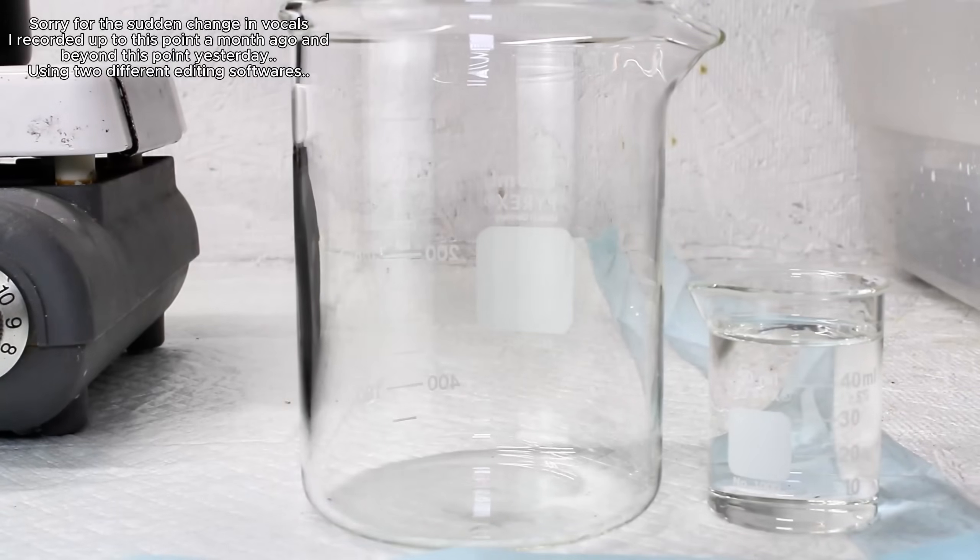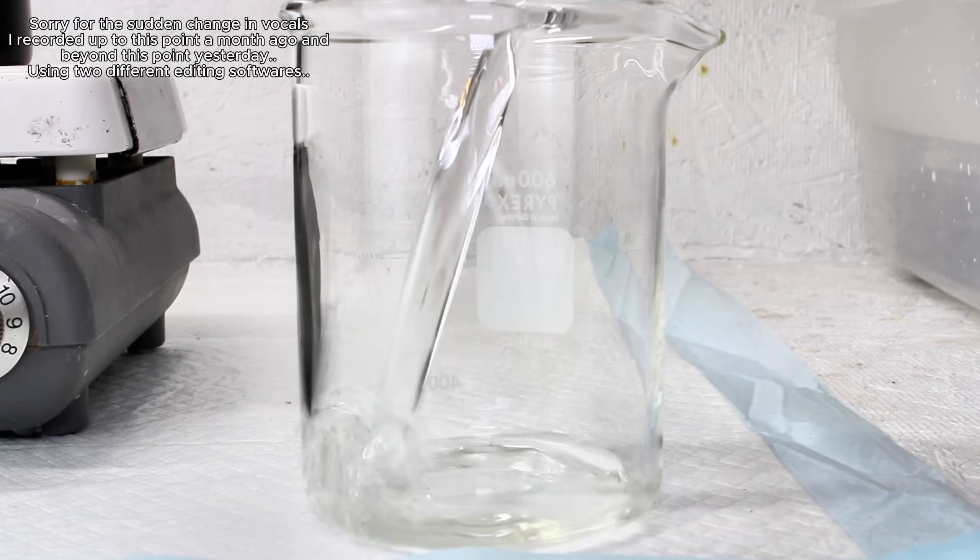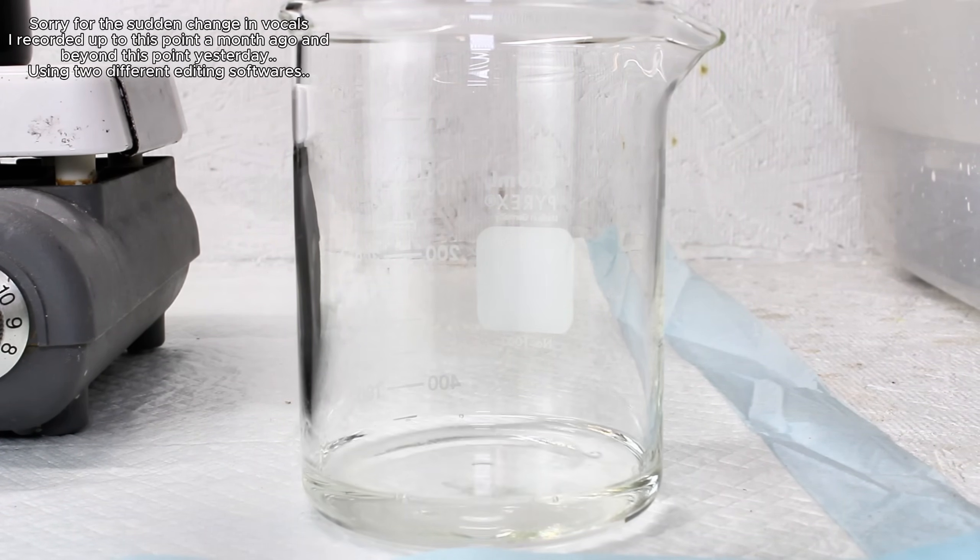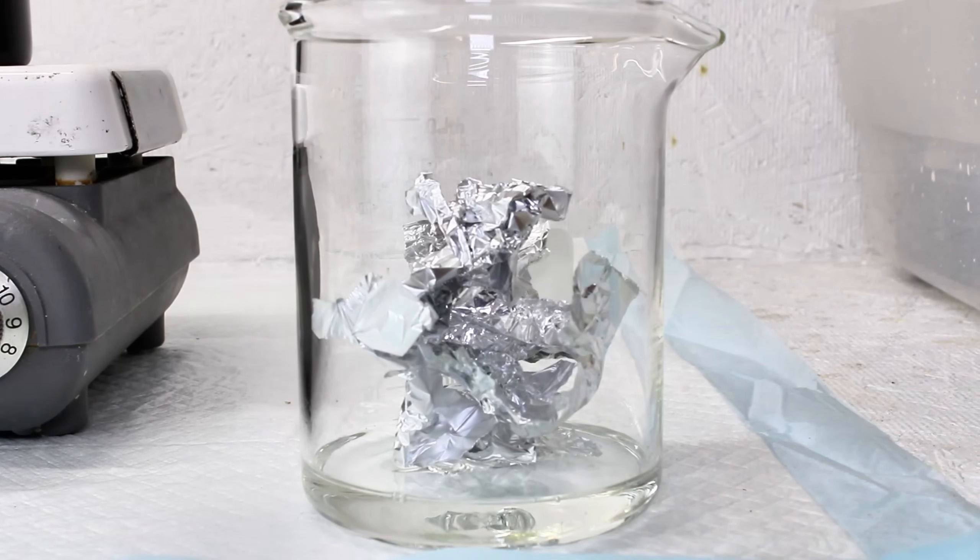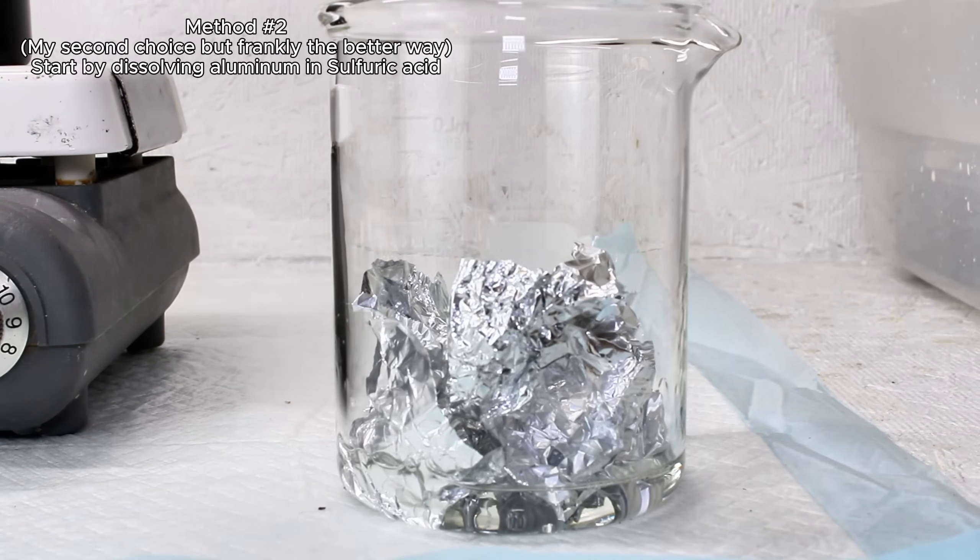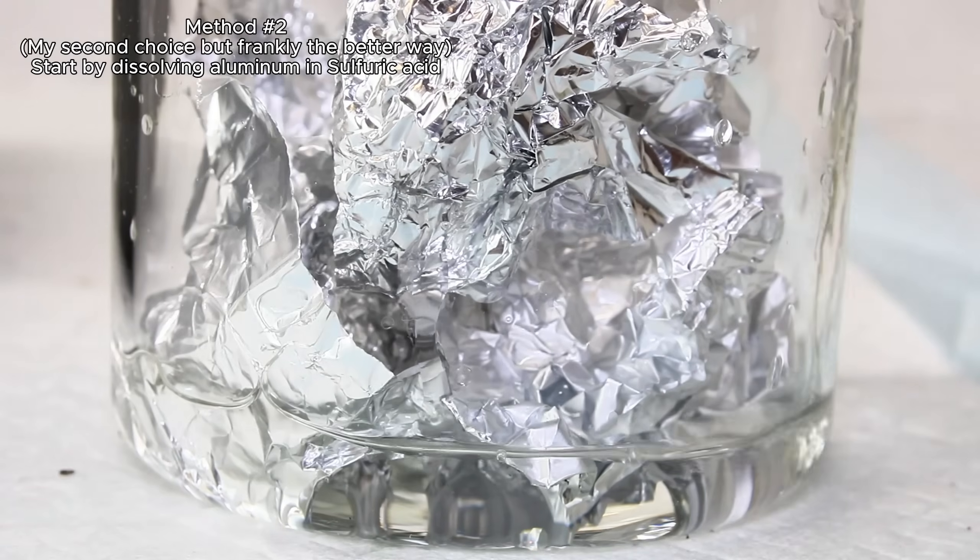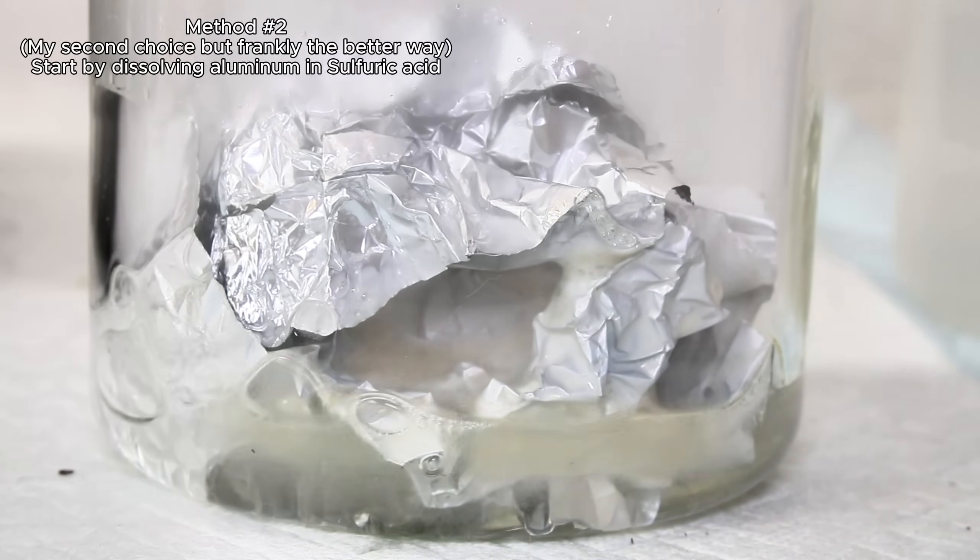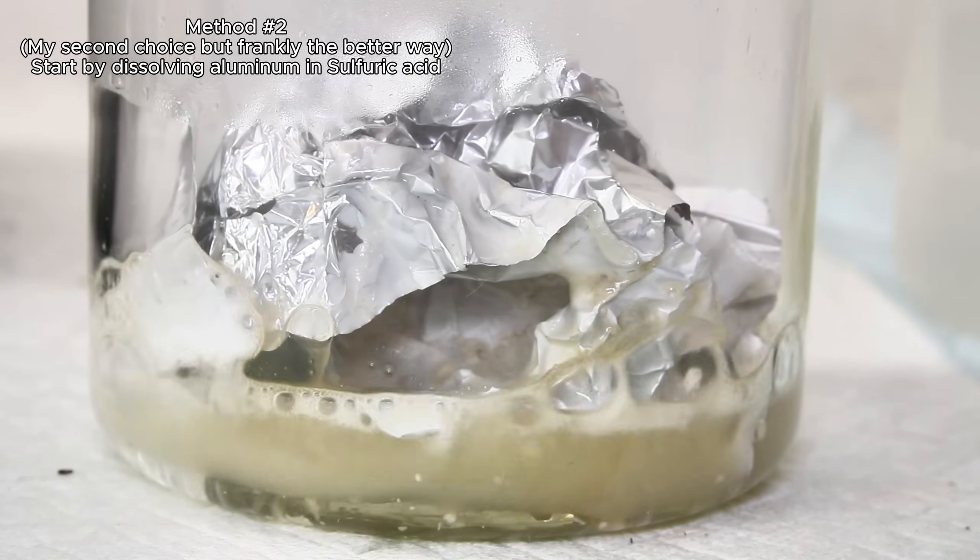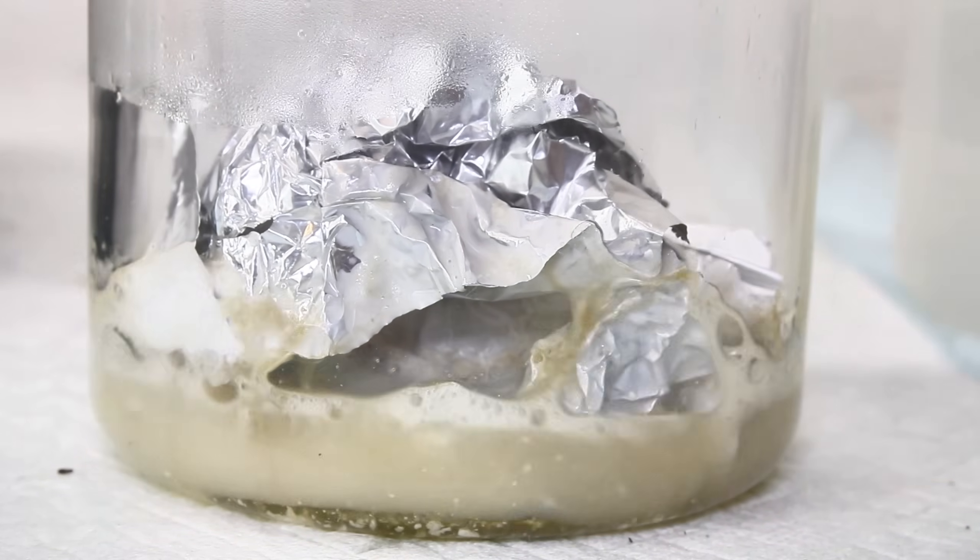Now my original plan was to end this video here, but I went back and tried this process again but in reverse, dissolving the aluminum first in sulfuric acid and then a subsequent neutralization with potassium hydroxide. I didn't think this process would result in a pure final product due to all the nasty byproducts produced when sulfuric acid dissolves aluminum foil, but it actually cleaned up surprisingly nicely and was honestly easier than my first method.